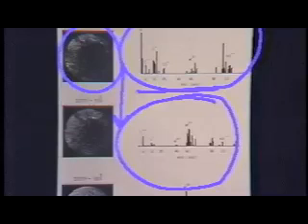So we can look at the implantation of helium or hydrogen in an operating fusion reactor in atomic resolution as a function of depth. And one of the things that we proposed to do originally was to extract from the depth distribution an energy distribution. Should be fairly straightforward. And it is, except that these experiments are done at room temperature, and as most of you know, hydrogen diffuses in metals rather rapidly.